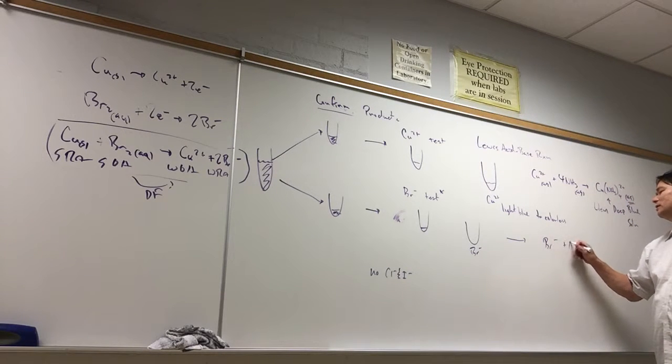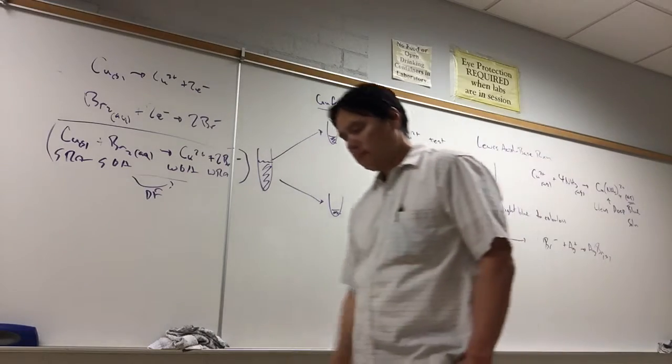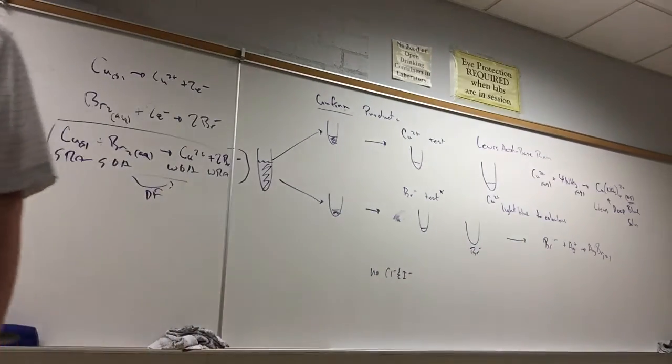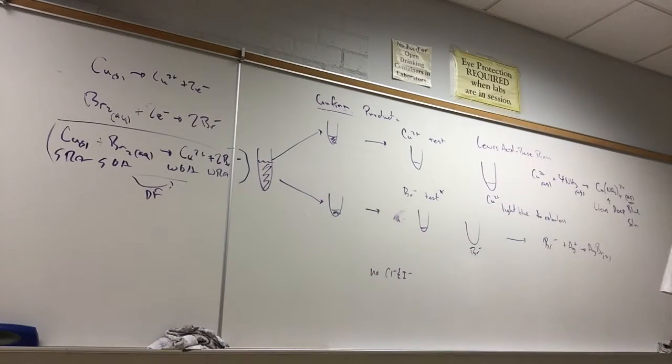But if we have bromide present, this is what kind of reaction? What kind of reaction is that? Off-white precipitate just means it could have a yellow color to it. It's off-white, a slight yellow color to it. What kind of reaction is this?